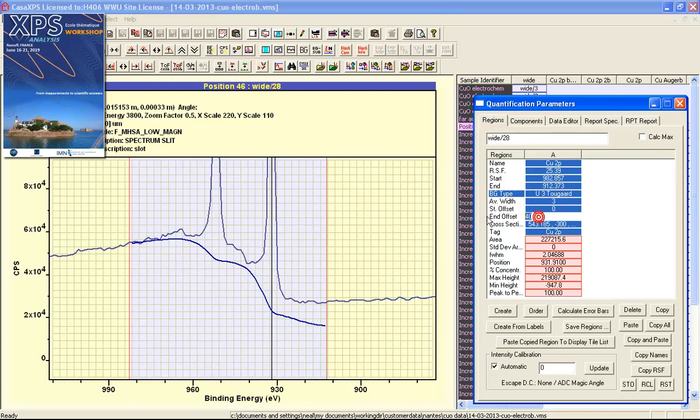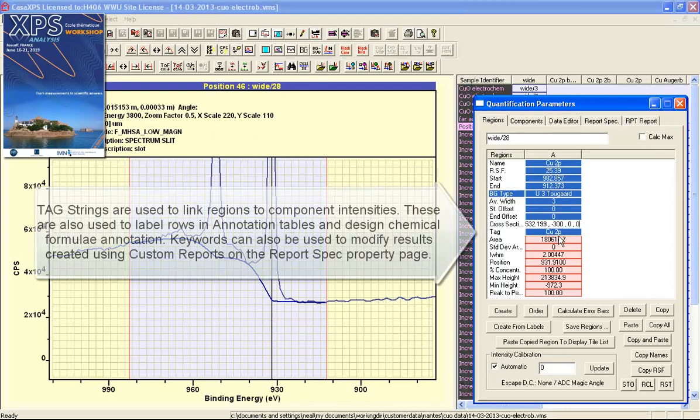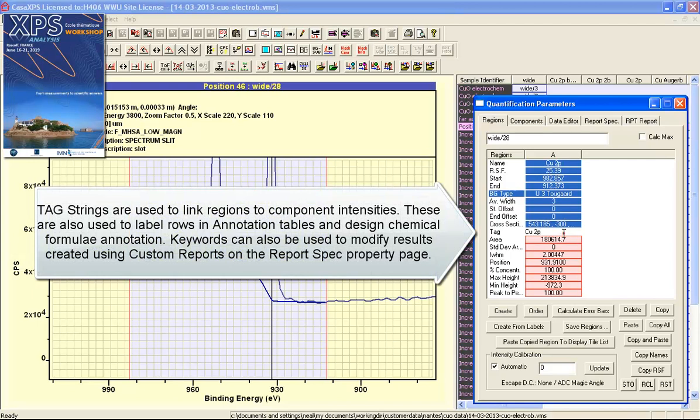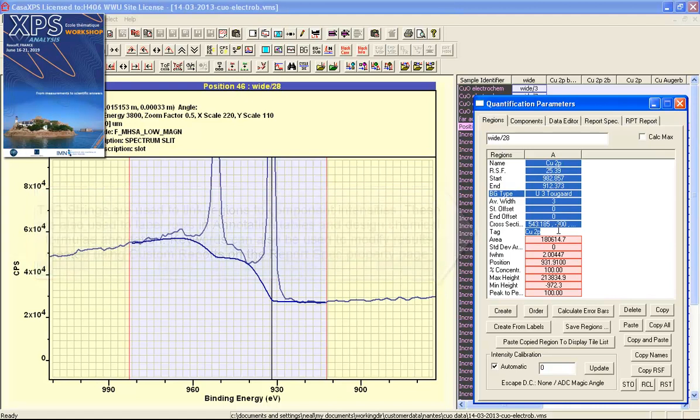I'll set these back to zero. Finally, there is a tag field. The tag field is a string that can modify how different pieces of information are extracted from a region when combined in a quantification report. For the most part, this is an alternative to the name field and is used also for annotation.